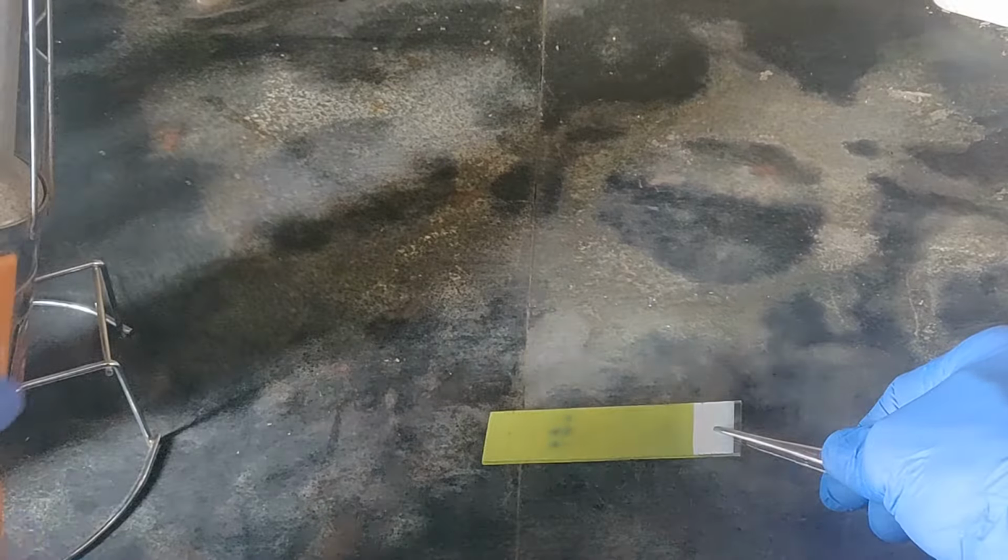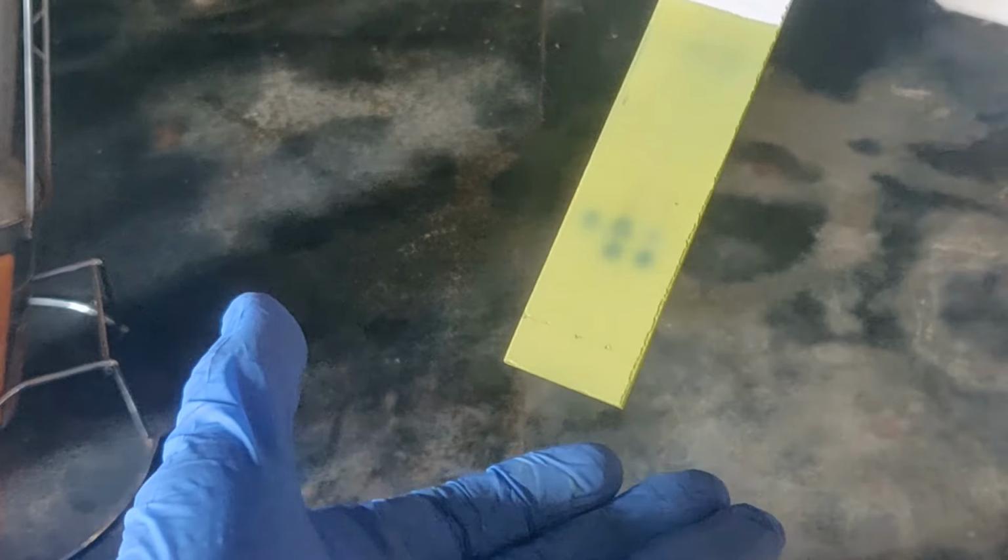You can see that the visualized component spots appear a very dark green against a lighter green background.